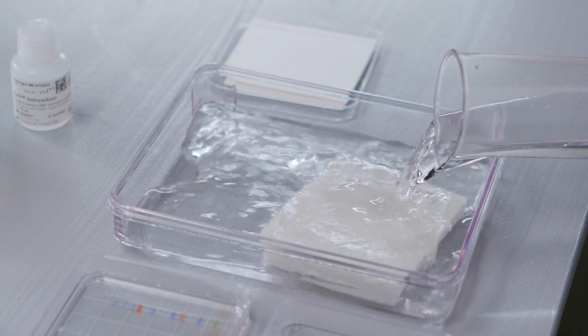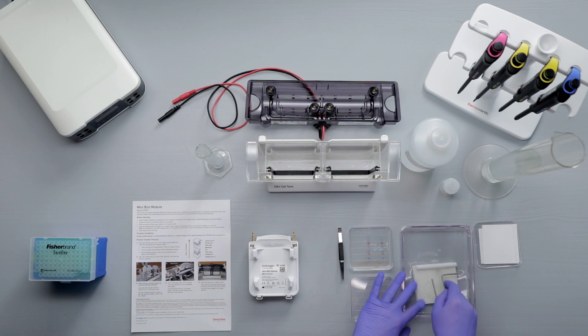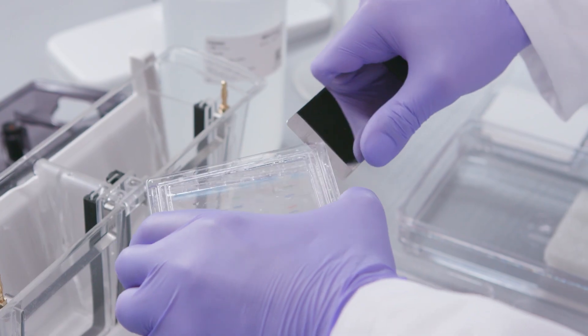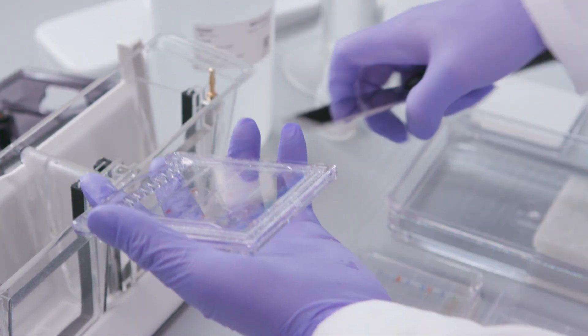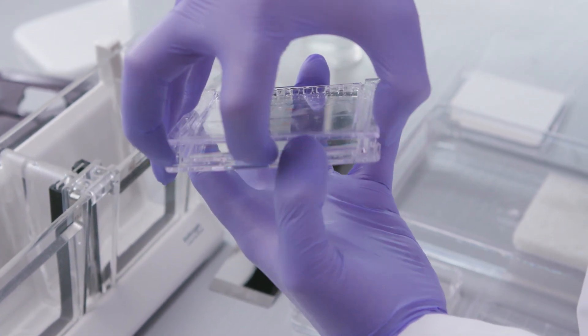Soak two sponge pads in transfer buffer and squeeze the pads to remove air bubbles. Open the gel cassette using a gel knife and carefully remove the wells and the foot of the gel so that the entire gel is of equal thickness.